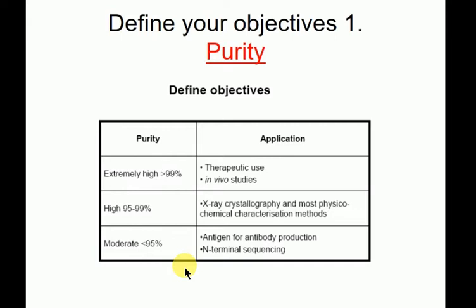The other reason a company would need it so pure is because if you're making it recombinantly, a lot of the other material present would be immunogenic. So, you know, you want to purify it away from all the cell wall, all the membrane lipids, because otherwise, if you inject that into a patient, their immune system is going to react to it badly. So right at the top end there, you need a massive degree of purity, 99% to 100%.